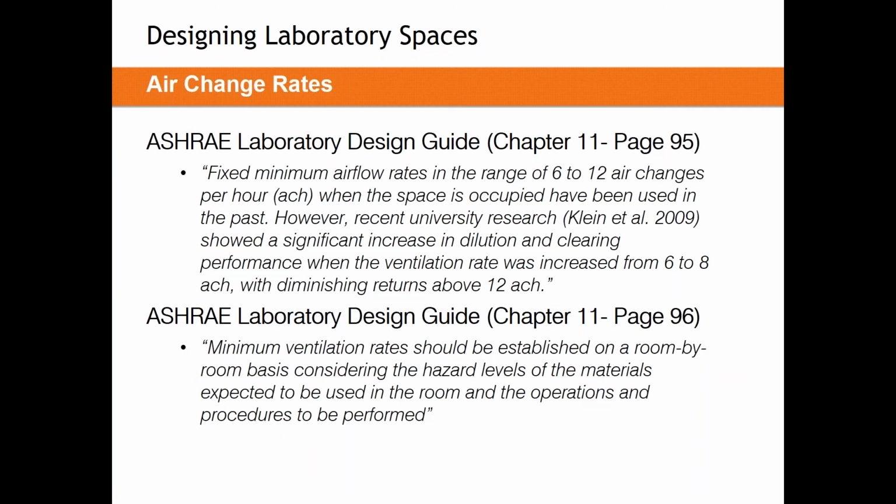This is a fairly hotly debated topic. You'll see lots of CFD studies. There's lots of different universities and organizations that are doing studies on this exact number to try to narrow it down. In my experience, they're all saying basically the same thing, that there's not a perfect correlation one way or the other. So the only thing I can really recommend for you here today is anywhere between 6 to 12. The most common I see is 6.